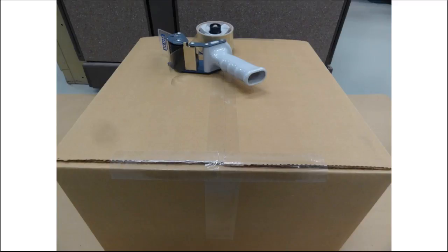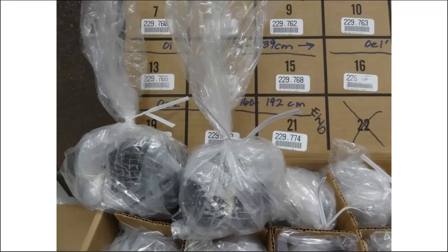And then once you have the weights and the dimensions, well, we know the dimensions, it's 18 by 18 by 12. If you give me different dimensions, I know you have the wrong box. We'll catch you. So that's the bulk samples.